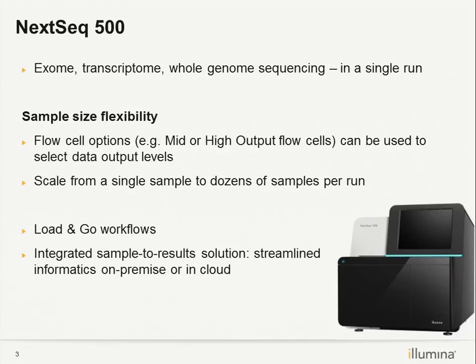Before we buy this app now, how do I know this type of Linux app? Setting up Linux basically aims to convert the bcl to FastQ, but we're not providing tertiary analysis like the apps in BaseSpace. So it all depends, we have all those pros and cons for different options. Is the conversion from the computer BCL to FastQ? Yes, it's basically that.